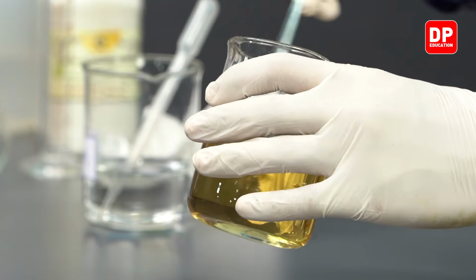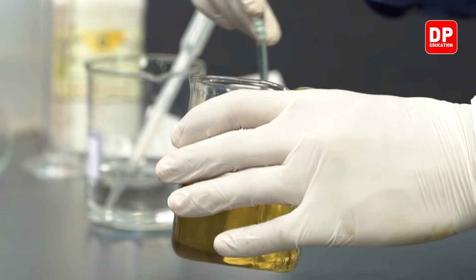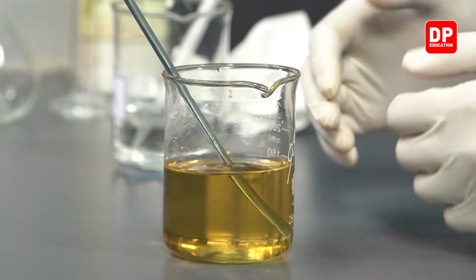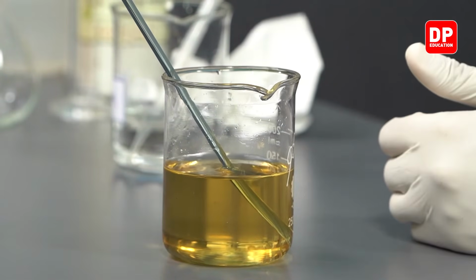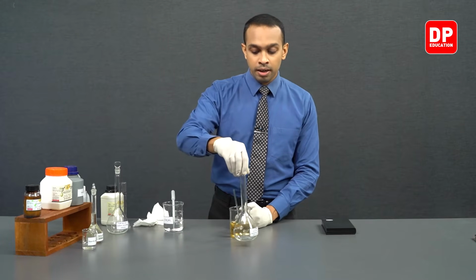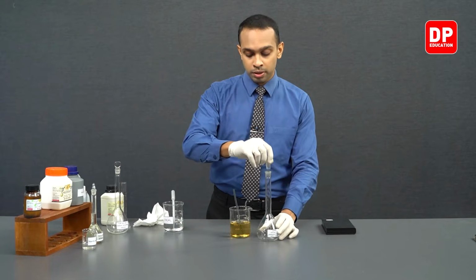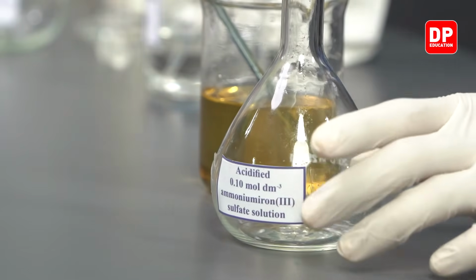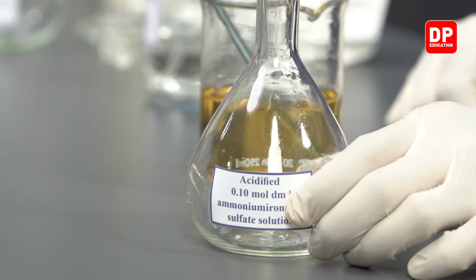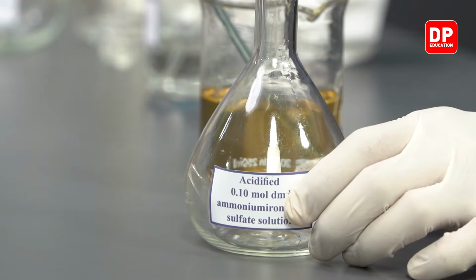Now, students, after dissolving all of the ammonium ferric sulfate solid in a small amount of sulfuric acid, we can now transfer this ammonium ferric sulfate solution into our volumetric flask. So this volumetric flask is labeled acidified 0.1 moles per decimeter cubed ammonium ferric sulfate.